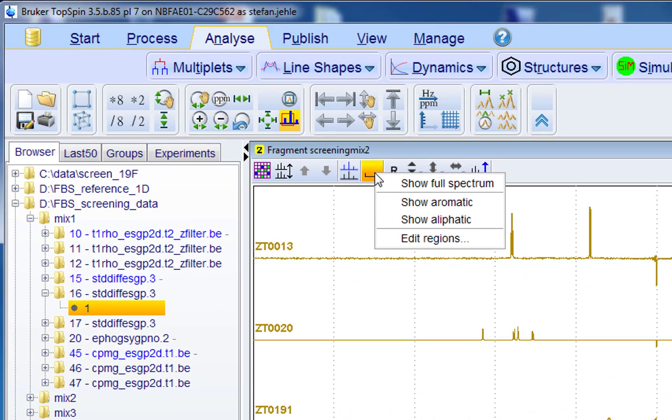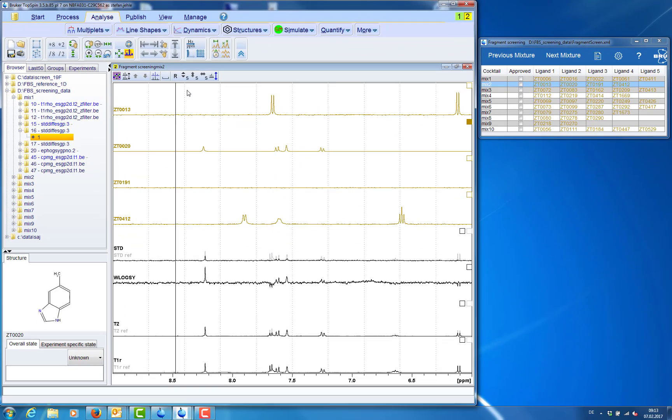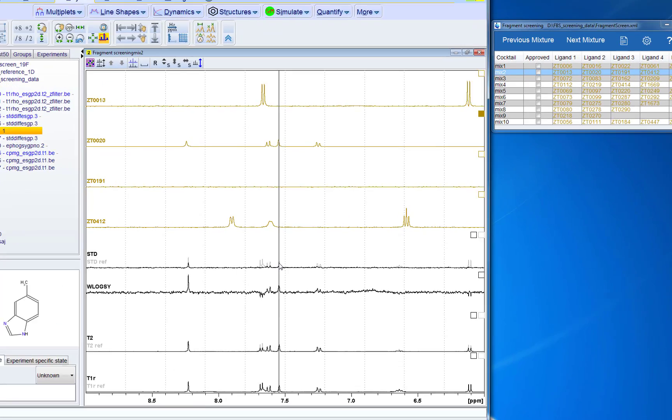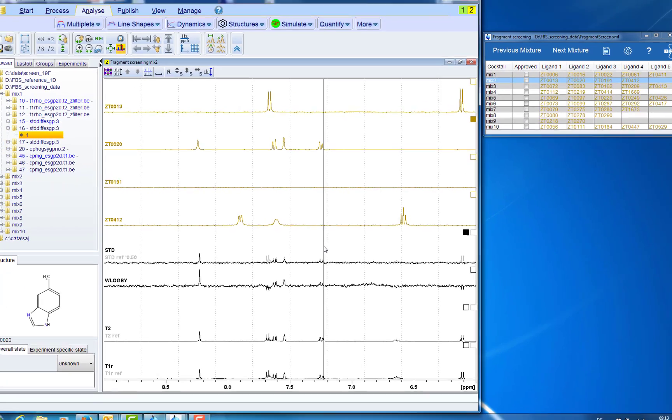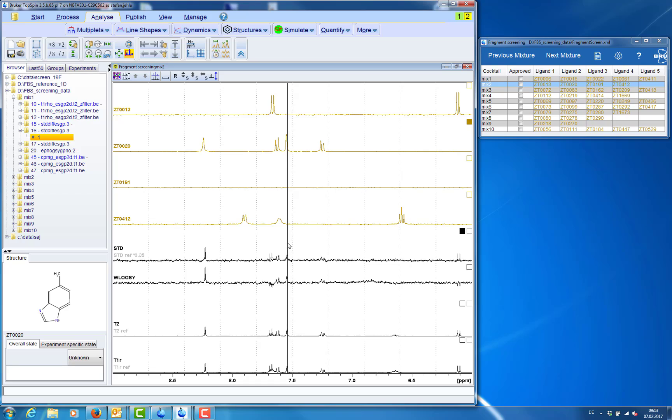Now we can use the shortcuts to jump between display regions. For example the aromatic regions. We can select individual spectra and scale them by using the mouse wheel.